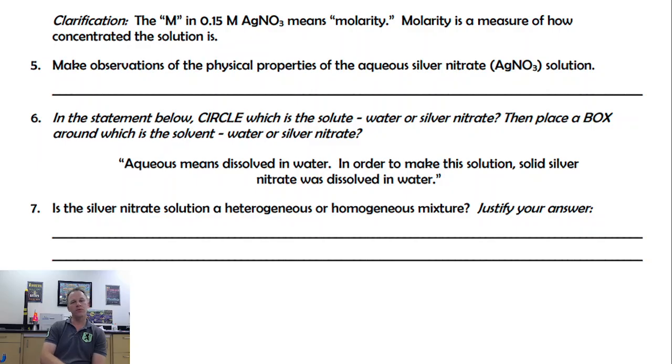All right, so when you saw the aqueous silver nitrate for the first time, what did it look like? What were its physical properties? Probably said it was colorless or clear. Did you happen to waft it? Did you smell it? It's okay if you didn't.